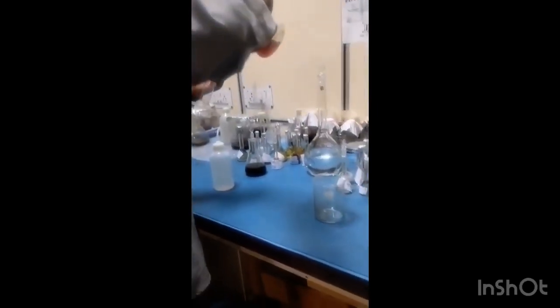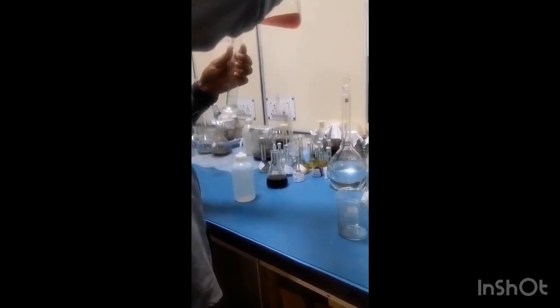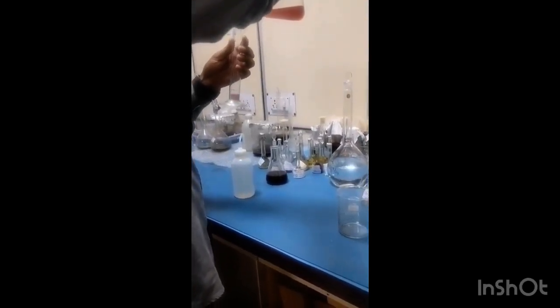Now take 20 to 30 ml extract and check pH. If pH is more than 5, then maintain it by adding dilute acetic acid, and if pH is below 5, then add NaOH to maintain pH approximately 5.